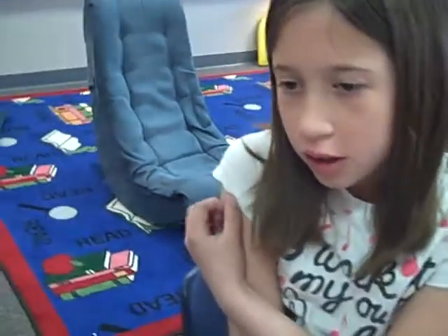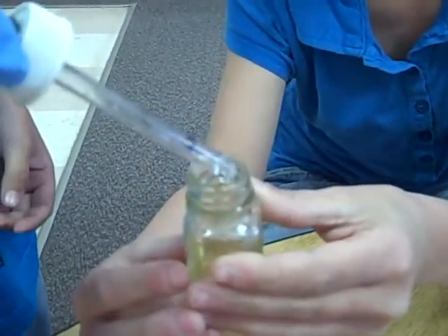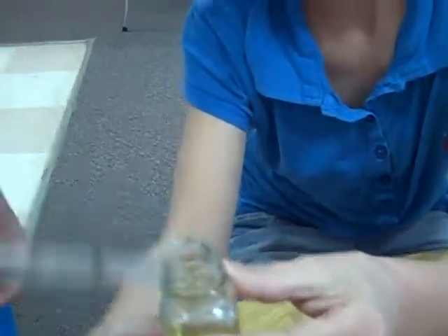I'm filling the yellow water all the way up to the ten milliliter mark. We are now adding drops of sodium thiosulfate until the solution turns clear.